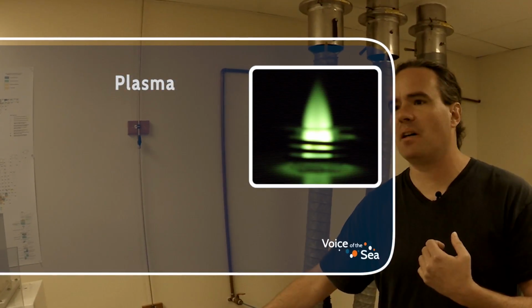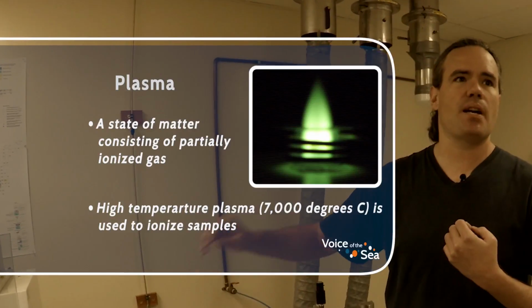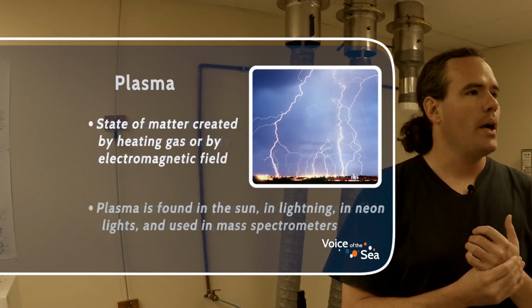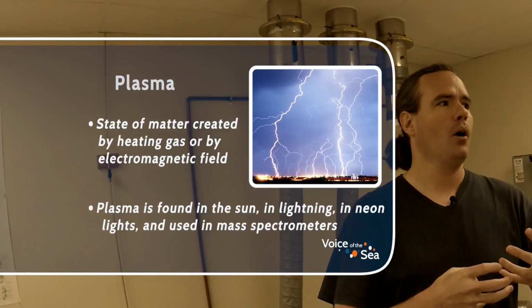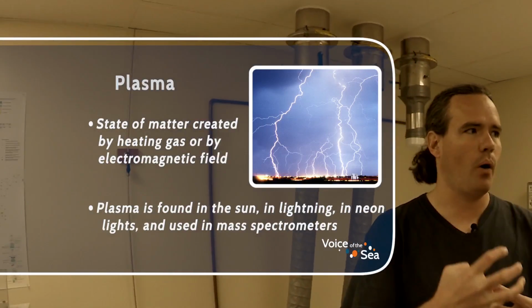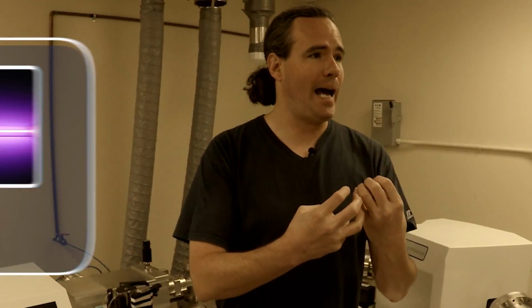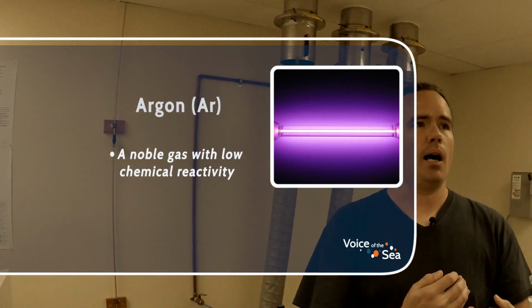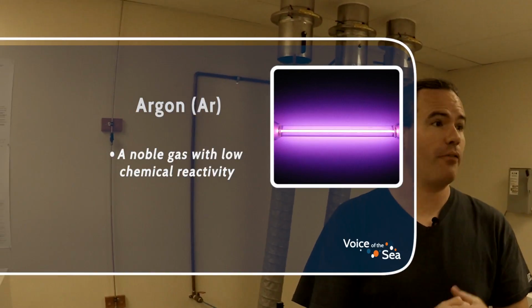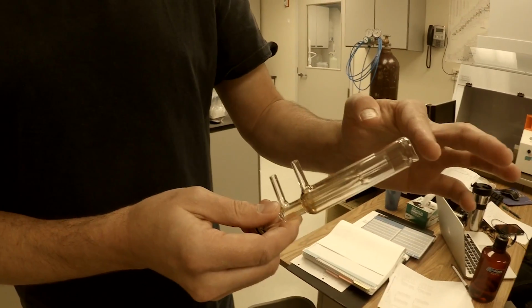So a plasma is essentially, in this case, a flame, about 7,000 degrees. And we make it with what's called an RF generator. We pump radio frequency radiation into a coil through which is passing a large amount of argon gas, and that is sufficient to excite argon, which is normally a noble gas, which doesn't form ions, but it can actually ignite something that normally would never burn. The flame that you see was actually right here.